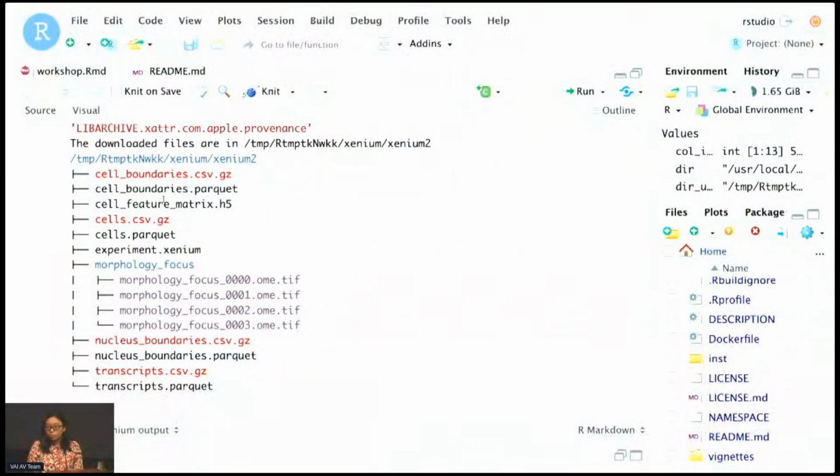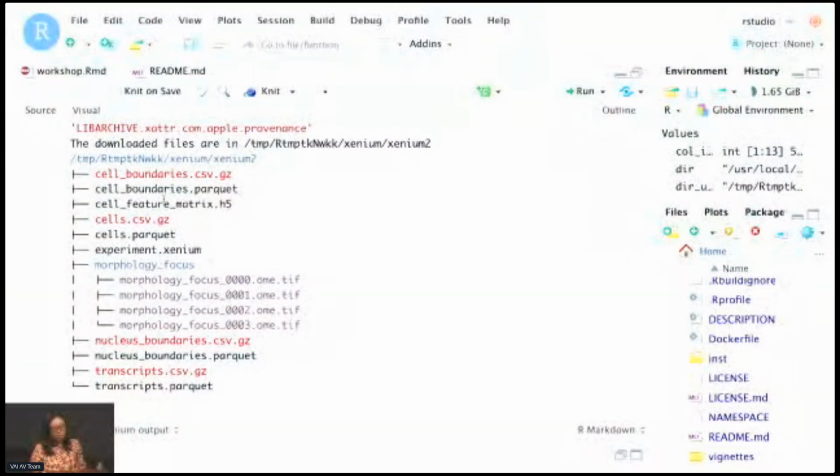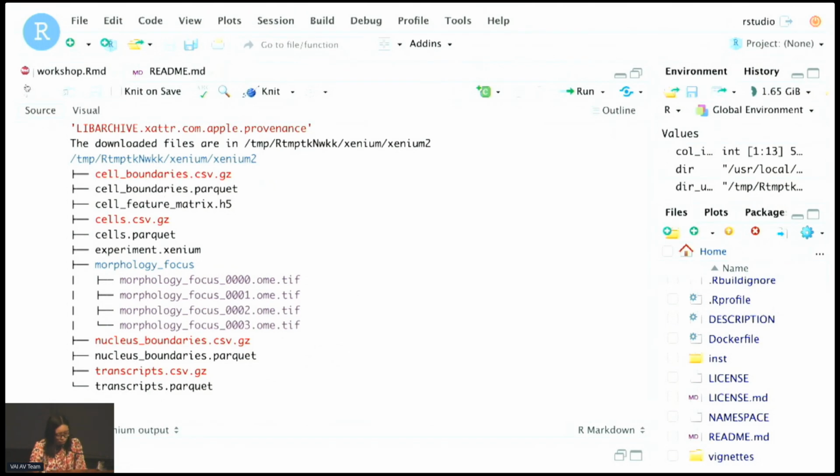Do you recommend running cell segmentation on the H&E and DAPI pre-Visium to then align to the image for this type of analysis? Yeah, you can do that. Although Space Ranger doesn't do it, but you have H&E, so you can do it. You just have to do it on your own. And actually, I have done it myself for one of the Visium example data sets in SFEData. Yeah. So back to Xenium.